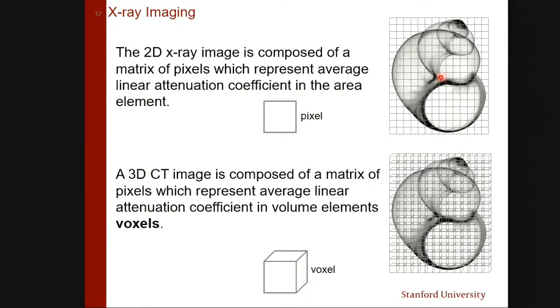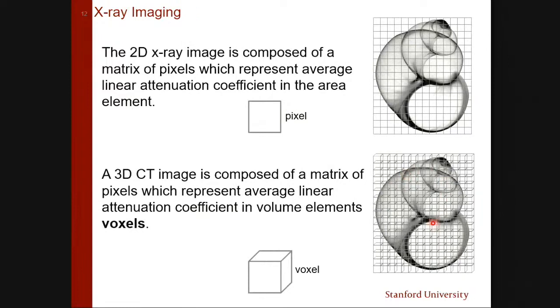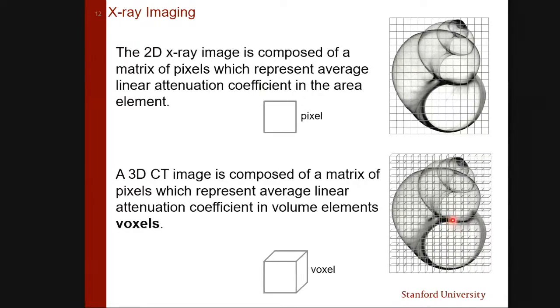So if, for example, an object is big like this, and this object is represented by many, many voxels, then of course the object is determined pretty well. But you can imagine if, for example, this line is represented by one voxel, you wouldn't see this object as this. You will see that the whole line will be within this voxel, so it will be a cube. One cube. So if you have, for example, a voxel size of 1 micron, and you have an object of 1 micron, you wouldn't see if this object is round, or a cube, or elongated, you will see a cube, because the whole voxel will tell you one grayscale. Within a voxel, there is no difference of intensities, right?